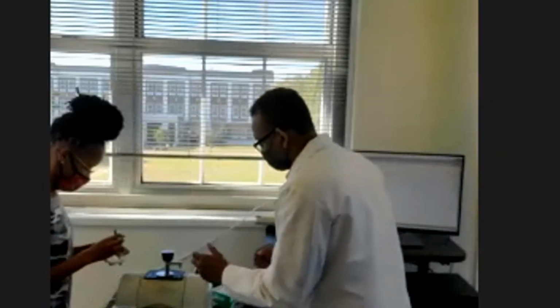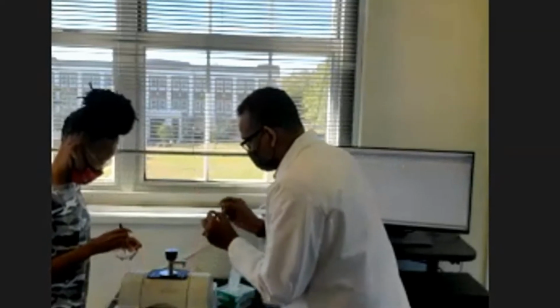Can you move a little bit to the side so everyone hopefully will be able to see it? You just need to take any part of the sample, it doesn't matter. That's a lot, but that's okay. I was telling you the advantage of the FTIR is that it's non-destructive, so if somehow you ended up with milligrams of the sample, you can run FTIR and you can recover it and still use it for any other thing. That's good enough.